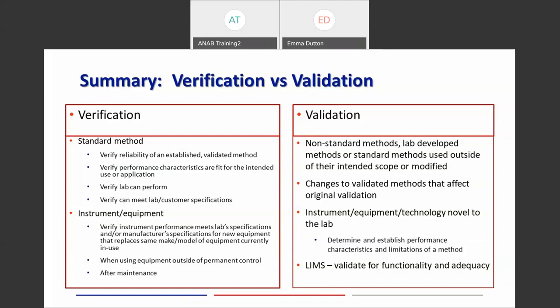So it's typically a validation of the piece of equipment in conjunction with the method that you're validating for how to perform and operate that piece of equipment. And of course, for any type of laboratory information management system, validate for functionality and adequacy.